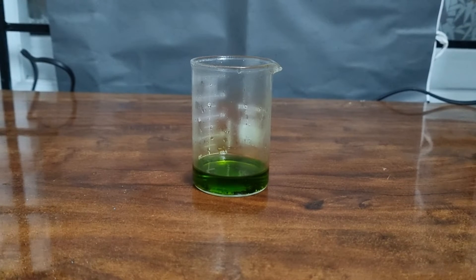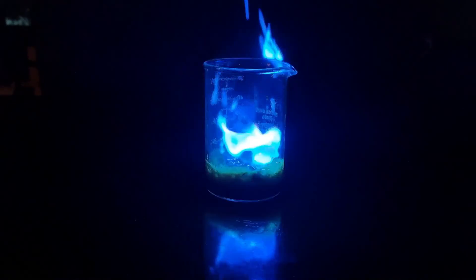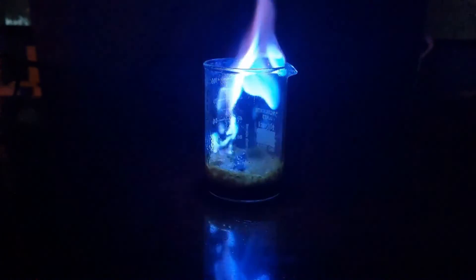The next thing I need to add is aluminum. When I drop some aluminum into this beaker, you can see this blue bright flame — how beautiful it looks! This is because the aluminum reacts with the hydrochloric acid to form hydrogen gas, and the color comes from the copper ions.